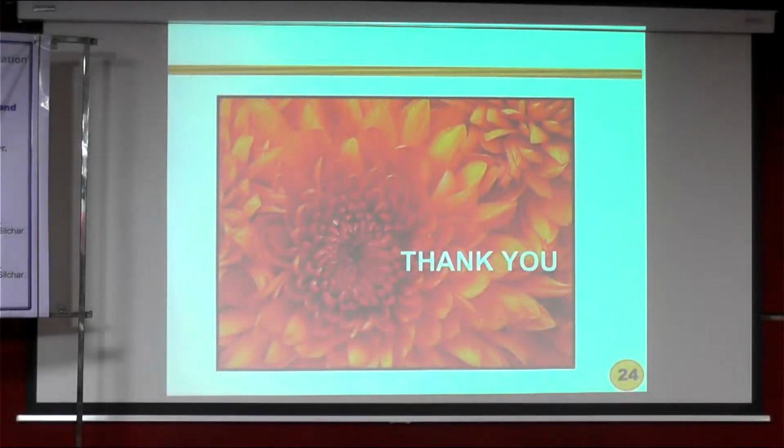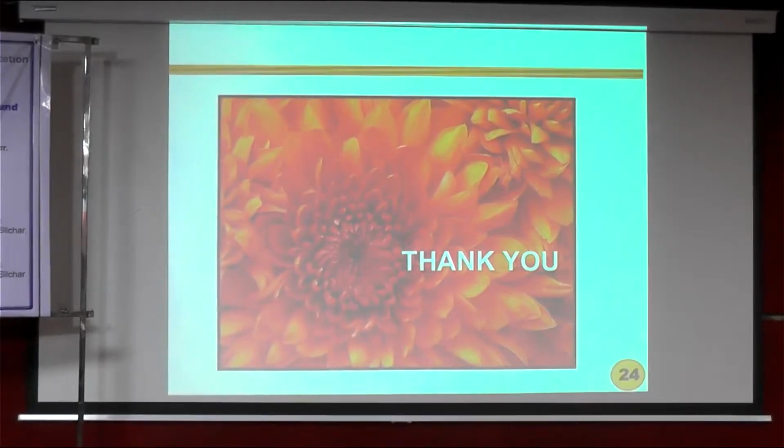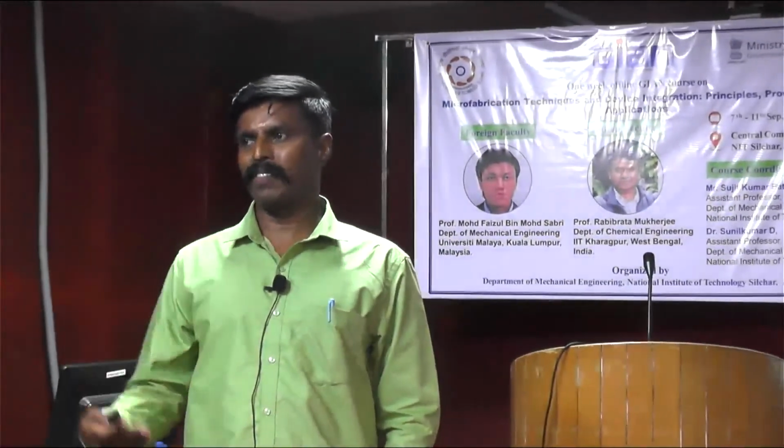This is all about material characterization. We have seen visual examination, then microscopy like optical microscopy and scanning electron microscopy, the application of X-ray diffraction, the application of energy dispersive spectroscopy (EDS), then microstructure characterization, then mechanical property evaluation by hardness measurement or tensile testing, and the mode of failure.